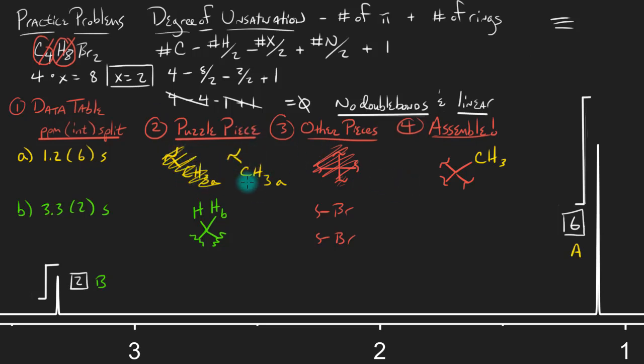So one other thing to think about is that since these CH3s were equivalent, since they're being displayed by the same peak, it means that we're going to have some kind of mirror plane equivalency to make these 2 guys show up under the same peak. And the easiest way to account for that is to put those 2 CH3 methyls on the same carbon. So I can take my other CH3 and just put him right here, and then that takes care of this molecule. And what you'll notice is as we start to remove puzzle pieces, the puzzle seems to begin to solve itself.